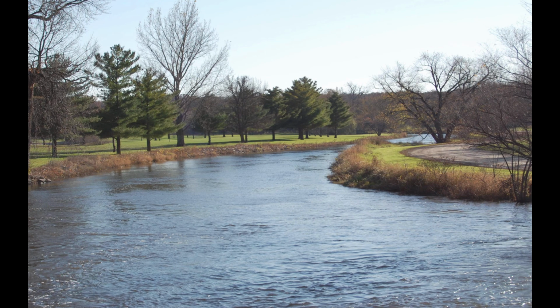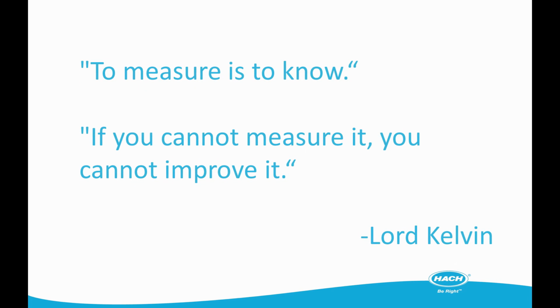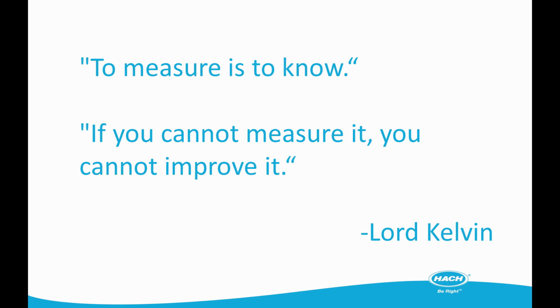To ensure the minimizing and removal processes in drinking water are more efficient, effective, and safer, the organics should be measured in raw and finished water. Measuring the organics in your drinking water system will allow you to optimize your source water strategies, oxidation processes, coagulation processes, and provide you with the essential data to maintain high drinking water standards in your communities. To measure is to know. If you cannot measure it, you cannot improve it.